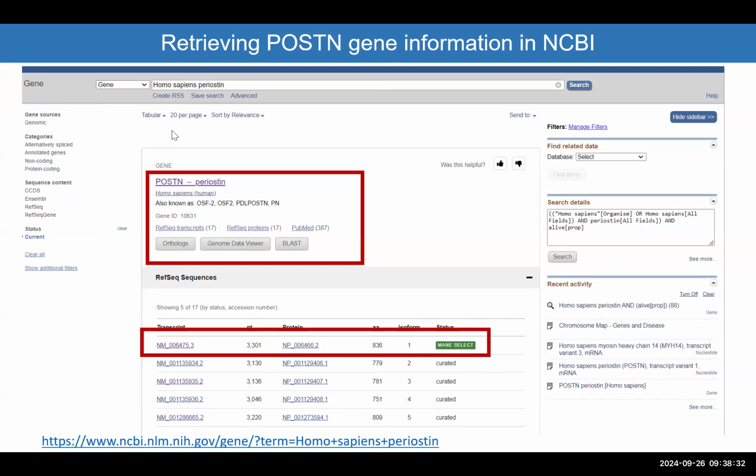If the gene is very well studied, there is this window that shows up where the RefSeq is emphasized. It will tell you the gene, and then it will tell you the reference sequence for this gene. It gives you the name, again, the ID of the gene that is shared between NCBI and other genome browsers like Ensembl.